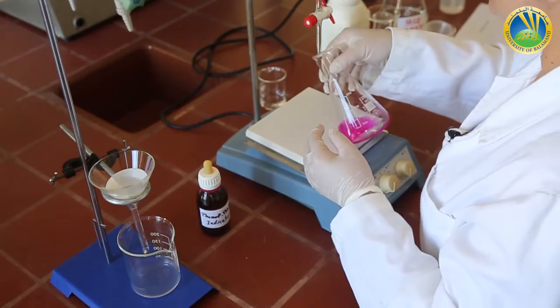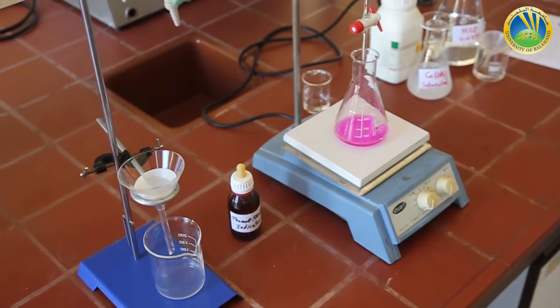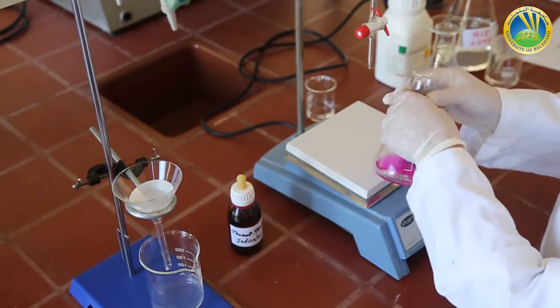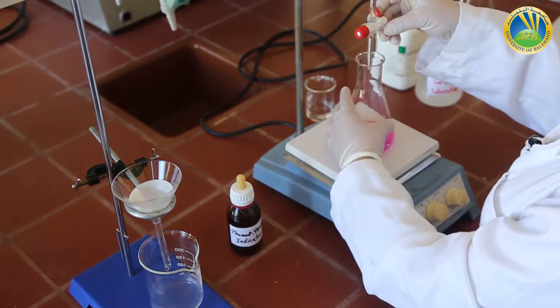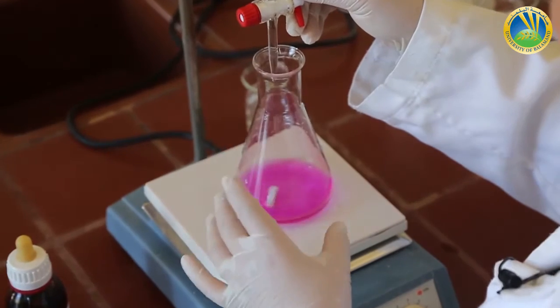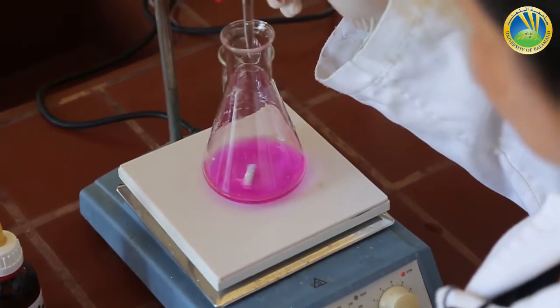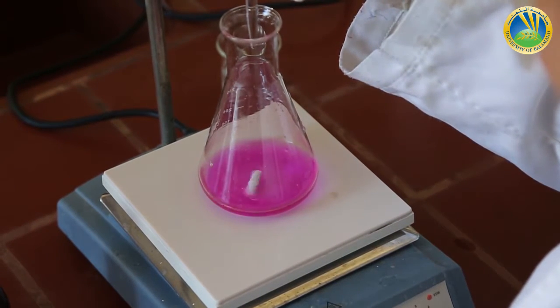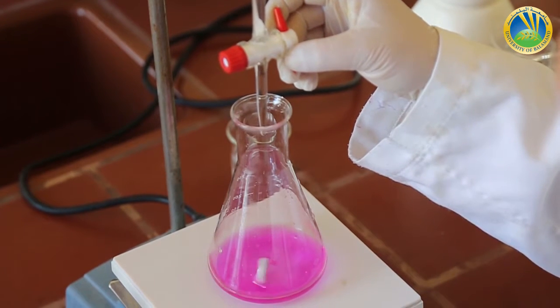I insert a magnet bar into the Erlenmeyer flask, place it at the center of the stirrer, turn the stirrer on, and start adding my titrant which is HCl 0.05 molar. The color transition will be from pink to colorless because the solution after the equivalence point will be acidic, and phenolphthalein is colorless in acidic solution. I don't know exactly the volume of titrant needed, so I must proceed dropwise.